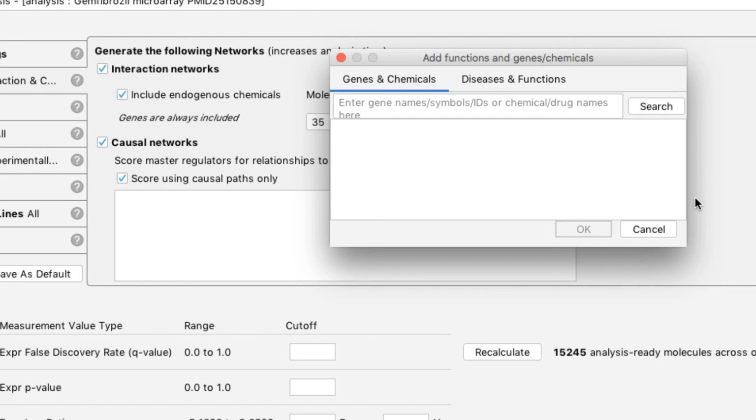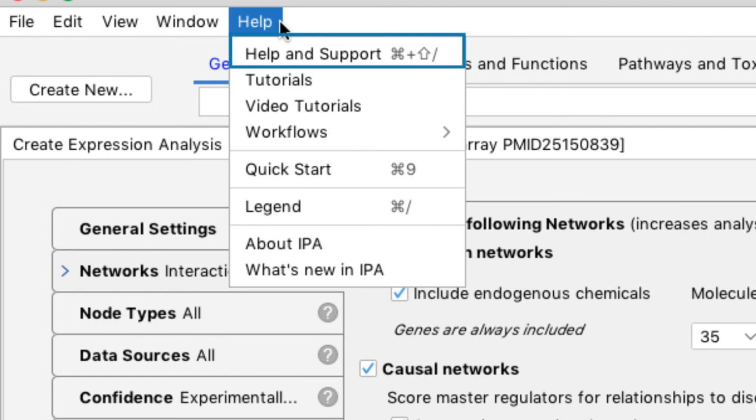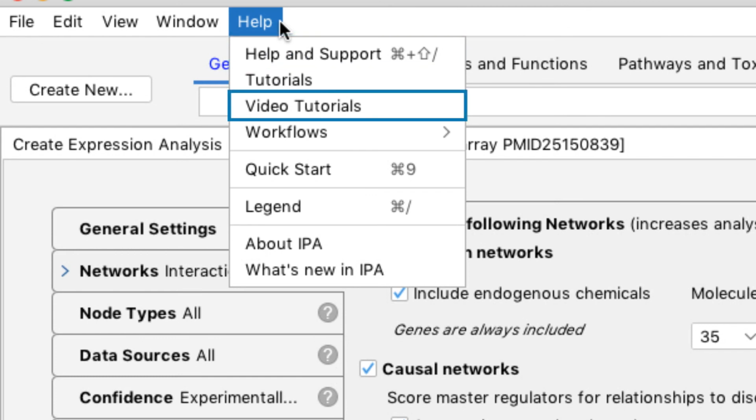For more information about upstream analysis, you can go to the Help menu to access our online help manual or watch our video tutorials and webinars.